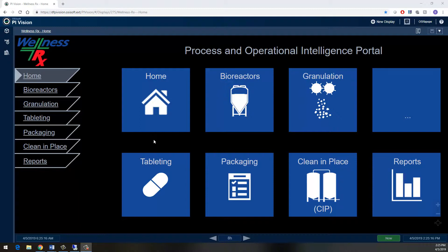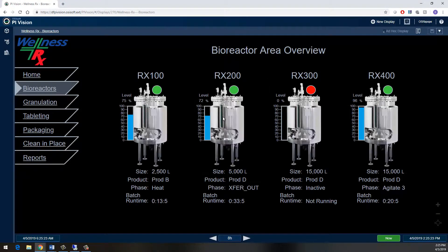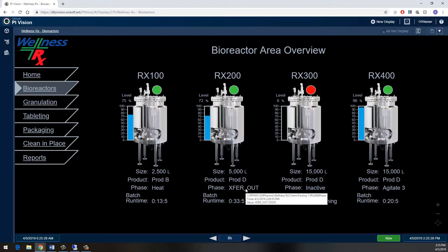In PI Vision, I can see real-time information from all over the plant in different process areas, but right now I want to focus on my bioreactors and where they are in their production. Right now I can see that three of my reactors are currently running, and one of them is almost complete and ready for transferring the material out for further processing.